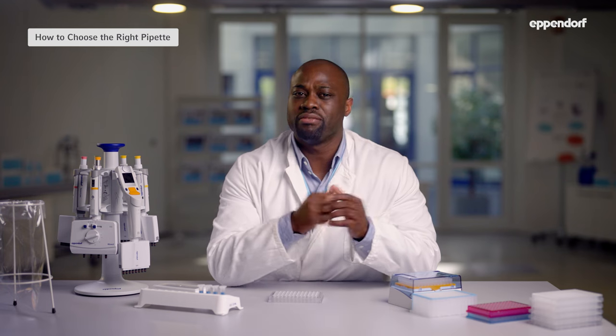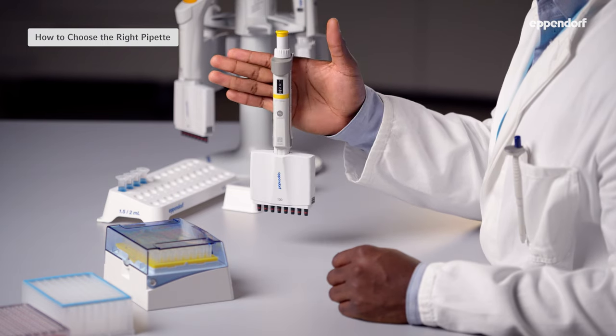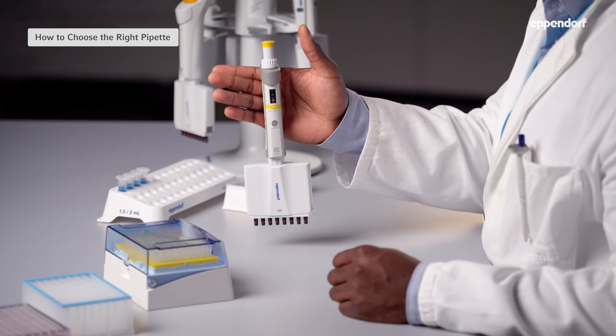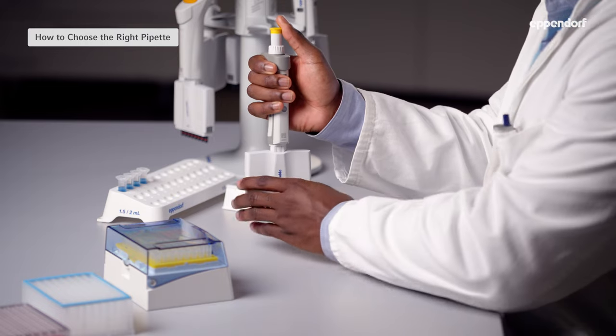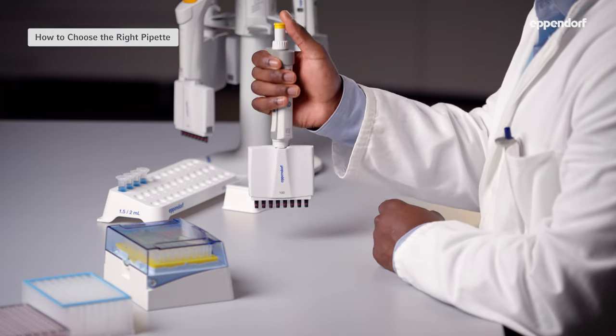Let's talk about how to choose the right pipette. When choosing a multi-channel pipette, you should look for the same things you look for in a single channel pipette: it should be accurate, precise, and easy to use. In addition, we recommend thinking about two extra criteria. First, it's important that your multi-channel pipette isn't too heavy and feels good and balanced in your hand. Second, don't forget about autoclavability and how easy it is to maintain the pipette.